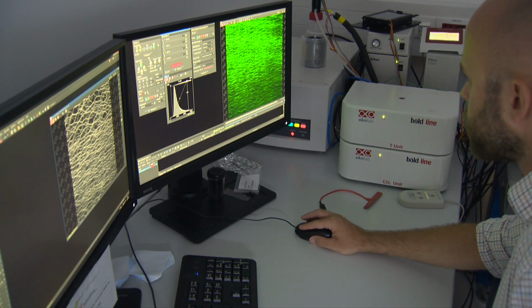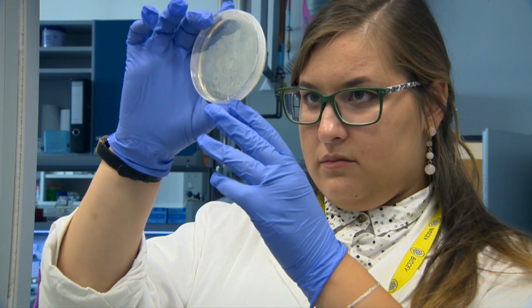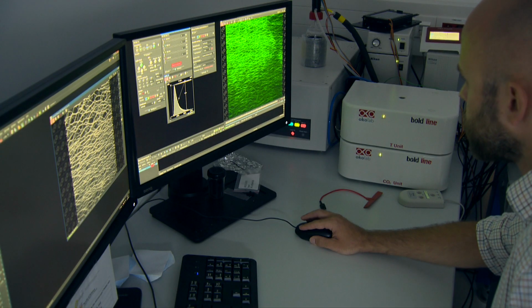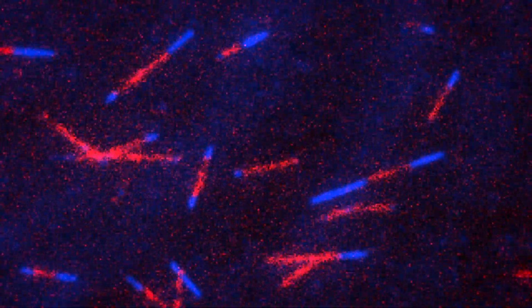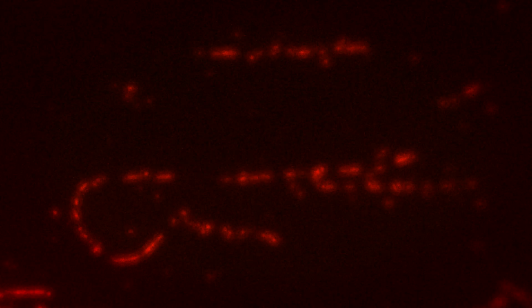Using this approach, we have full control over the system, which enables us to disclose the underpinning mechanisms that drive the movement in the living organism. We can thus visualize how cytoskeletal proteins form filaments, or how other proteins cut the filaments, how molecular motor proteins walk along the filaments, how they slide filaments relative to each other, and how they bundle filaments into higher-order structures.